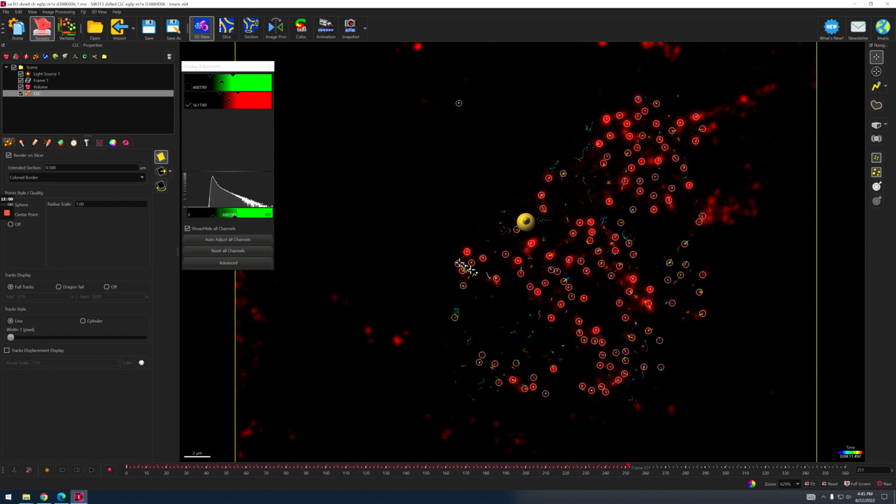And here you will see the spot module and the track have been built, and all these different colors are the tracks that I think are moving over time, so they have different colors. And the way to remove it, I always remove it because it's pretty disturbing on the image. And so I think we are good now.